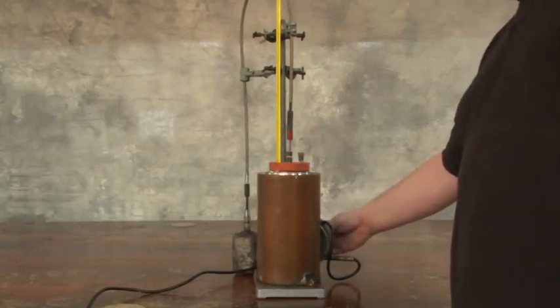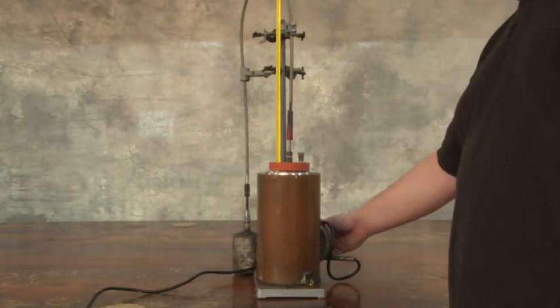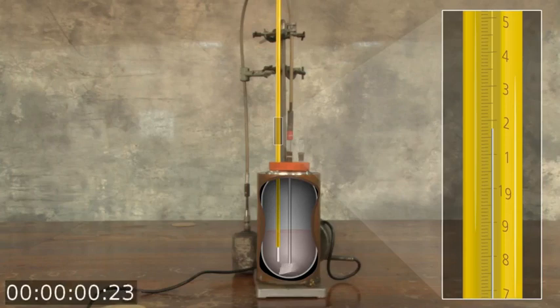Switch on the stirrer and allow 10 minutes for the sulfamic acid to dissolve completely and for an equilibrium rate of temperature rise to be established. We're going to jump 10 minutes forward in time so you don't need to wait. The initial temperature of the reactor at time zero is 19.18 degrees centigrade. You should have this written down.